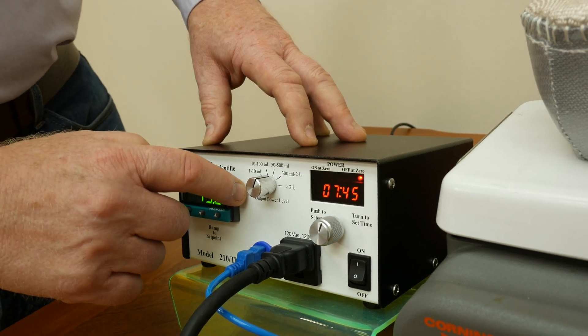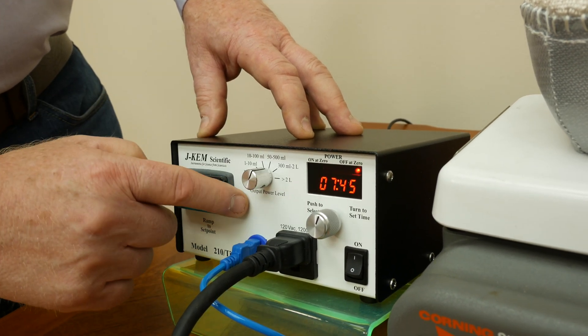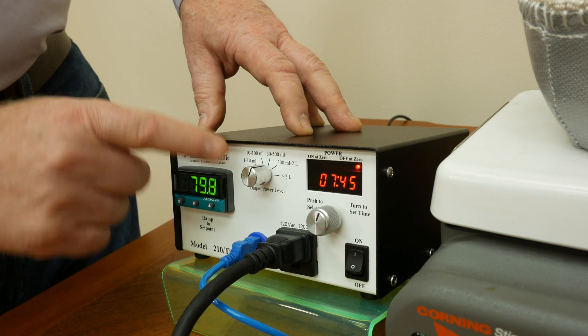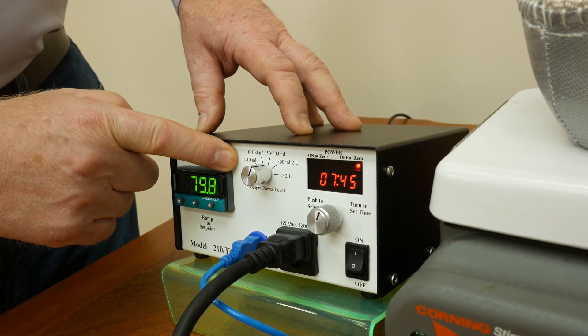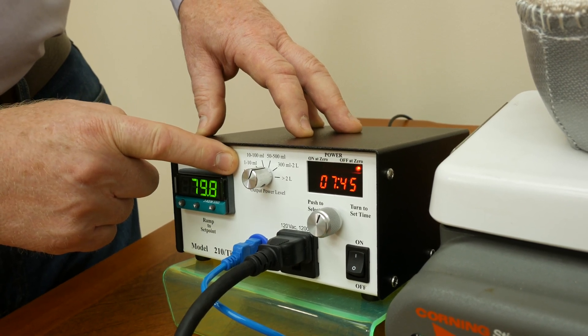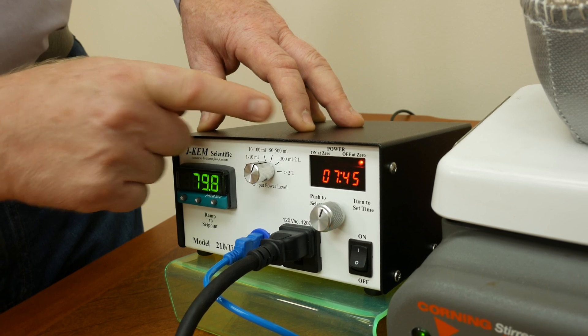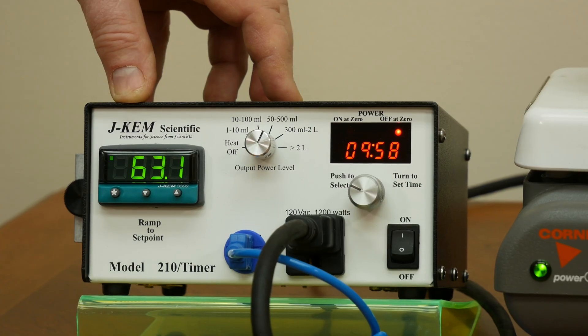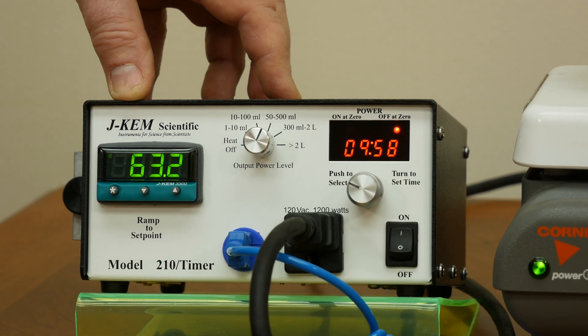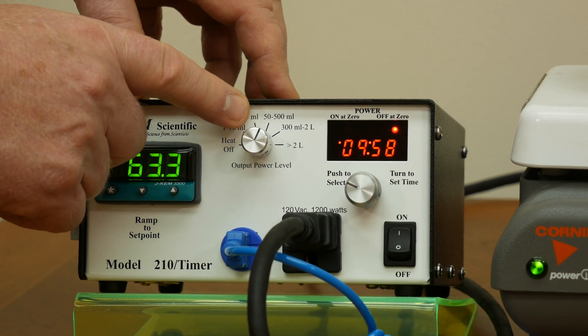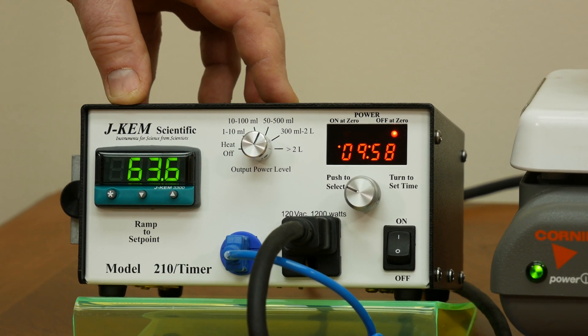The power control computer, you'll notice that it has various volume ranges on here and so the power that's being sent out to that heater depends on the volume that you're heating. It's simple. I know that's about 180 milliliters and so I'm going to set it to the power level which is 50 to 500 milliliters.